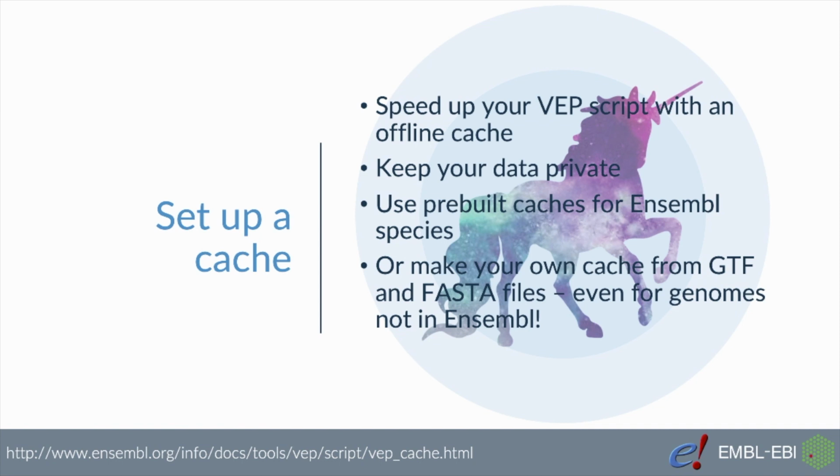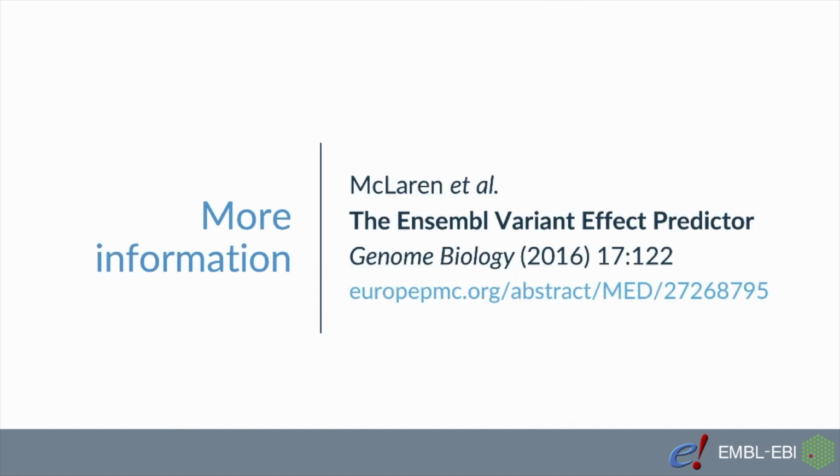Cache is basically offline VEP. It's a bunch of files and data that VEP needs to do its job so that it doesn't have to communicate with our database. The advantage of using cache is that it speeds up your analysis. You can keep your data private so that you don't have to submit your data online. It's good if you're working with sensitive patients' data. You can use pre-built caches for our Ensembl species, and you can also make your own cache if you have GTF and FASTA files.